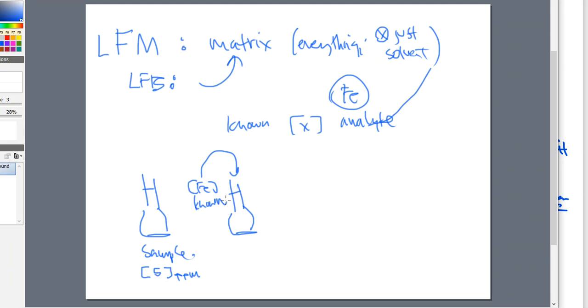So based maybe on a little bit of math, and we're not going to go into that right here, we're just defining definitions. What would happen is that I would make the decision, okay, based on the iron amount that I've added, my signal should go up by another 2 parts per million maybe, right? That's really up to the directions. It's up to the SOP. It's up to the company to determine how much of an increase they want to see here.